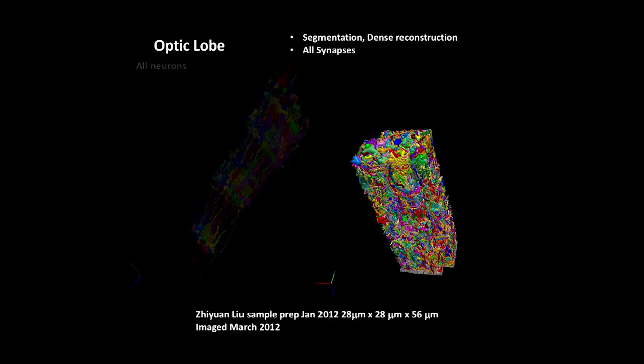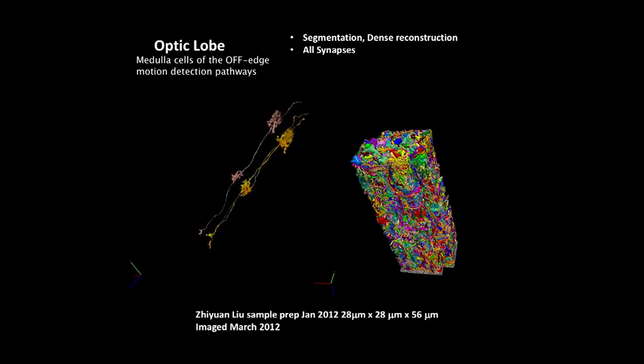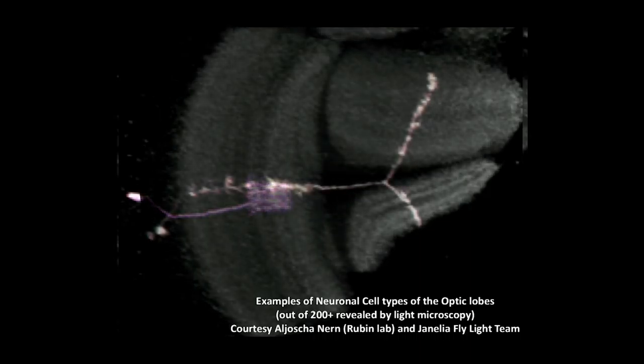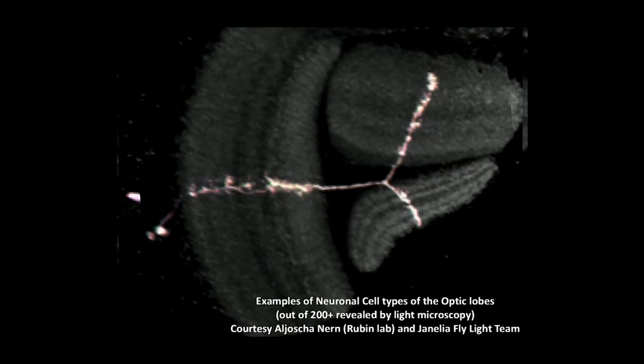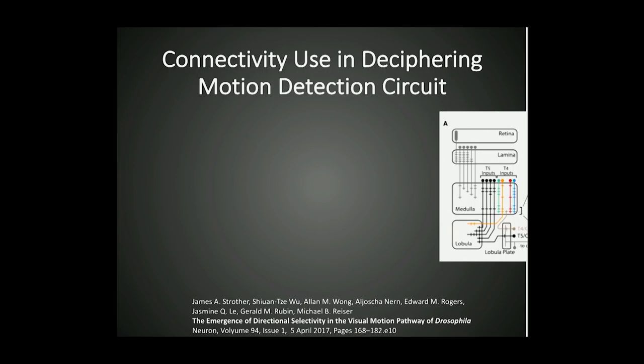For example, some of these neurons, this is coming in from the retina. Some of them are sensitive to an on transition, or to an off transition, or to a left to right motion, or front to back motion. And people can identify that based on optical imaging. But optical imaging can't tell you the detailed synaptic connectivity, but it can give you the classes of neurons so one can connect the two and bootstrap our way forward. In addition, optical imaging can look at live samples too and tell which ones are firing on transitions and off transitions, and we can actually monitor that. So all of that data can be put together, and you can begin to identify the components of a circuit diagram. And these are the three major parts that you saw earlier, the medulla, the lobula, and the lobula plate.